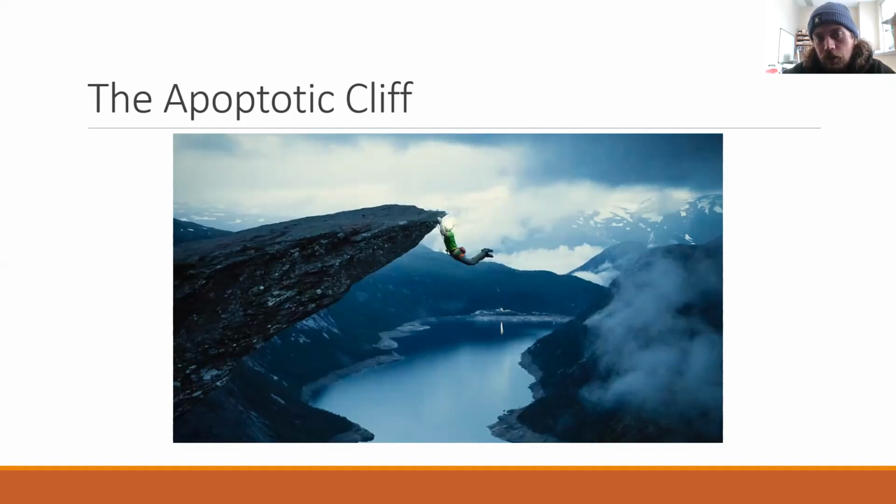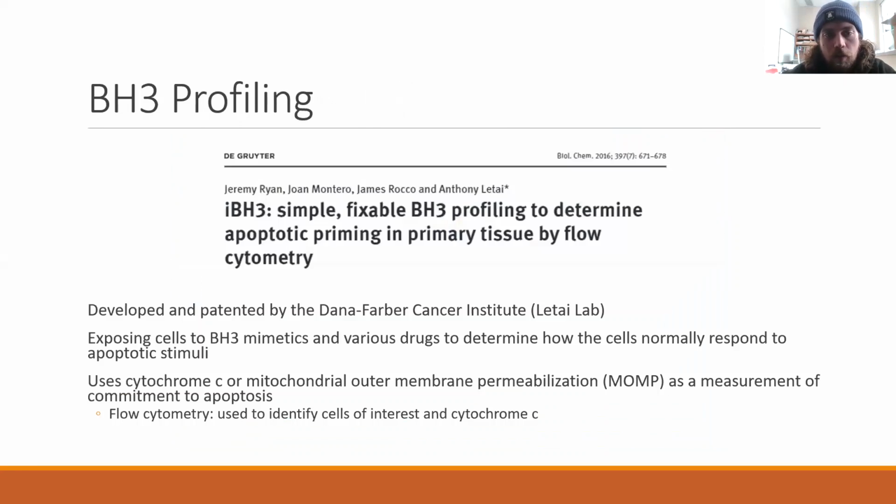Basically, we want to know how close our cells are to the cliff, and is there anything we can do to get them closer to the cliff? So that's where BH3 profiling comes in.